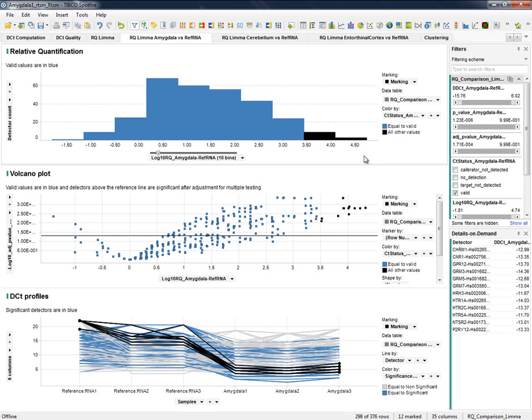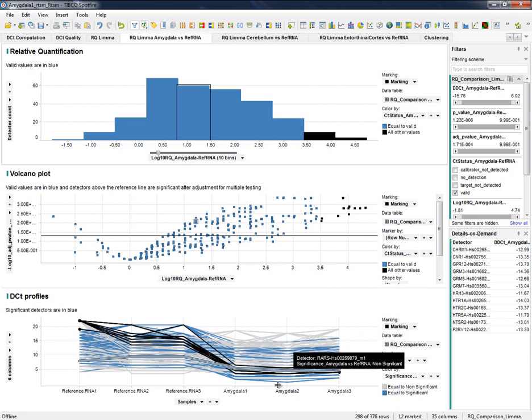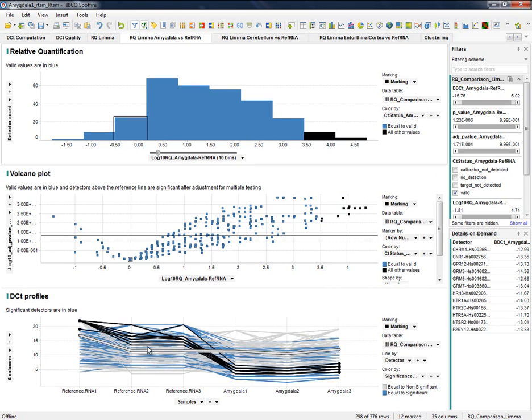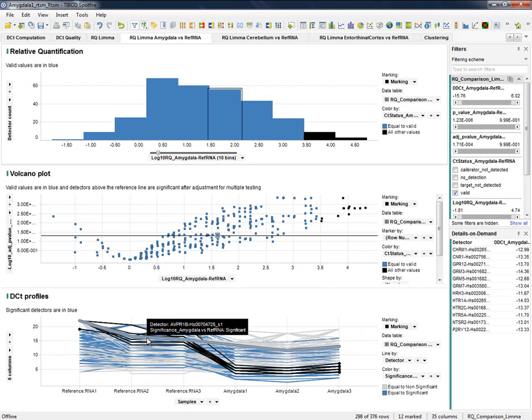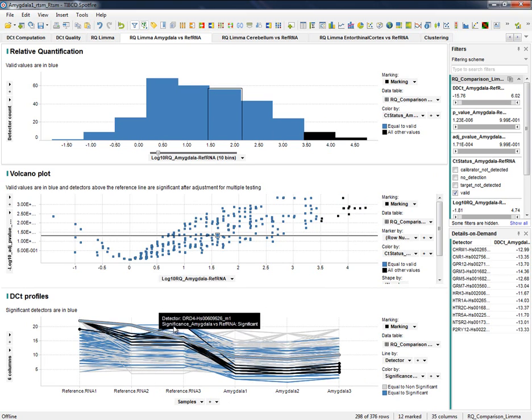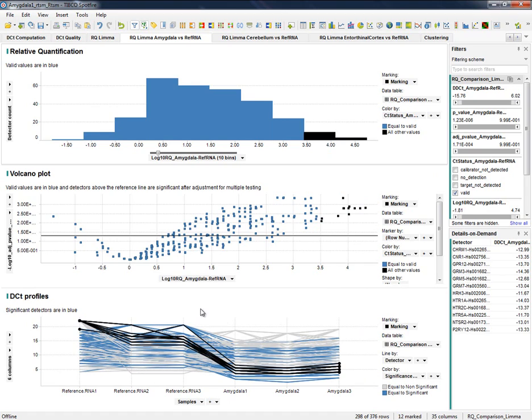Regulated ones fall on the right side of the RQ distribution. All visualizations are synchronized, so a visual inspection allows us to confirm that the expression profile of regulated detectors is clearly lower than the control.